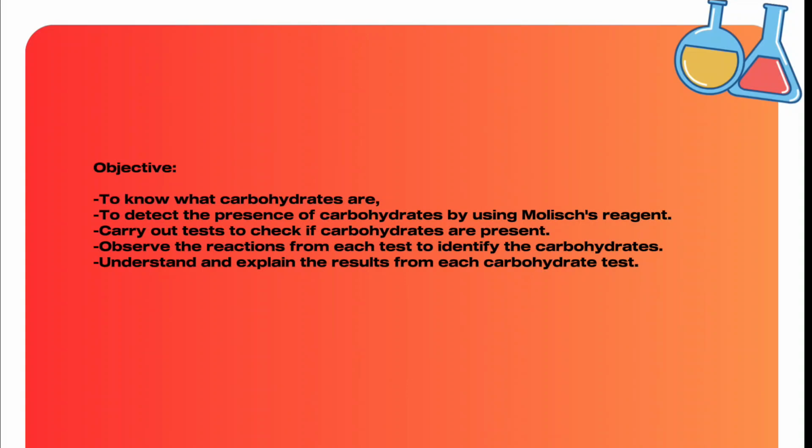Objective. First, to know what carbohydrates are. Second, to detect the presence of carbohydrates by using Molisch reagent. Third, carry out tests to check if carbohydrates are present. Fourth, observe the reaction from each test to identify the carbohydrates. And lastly, understand and explain the result from each carbohydrate test.